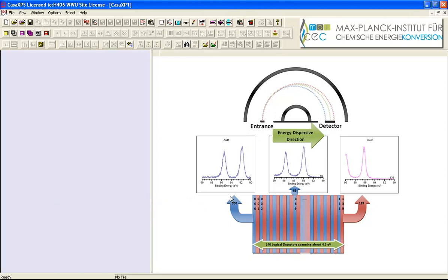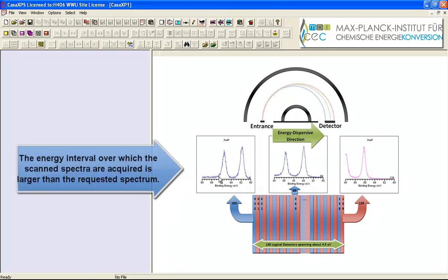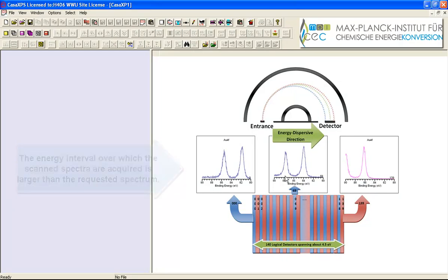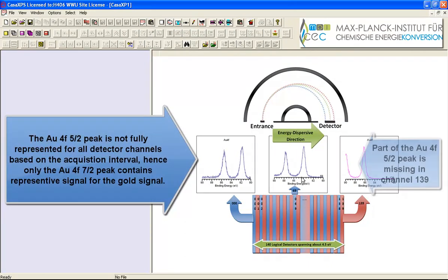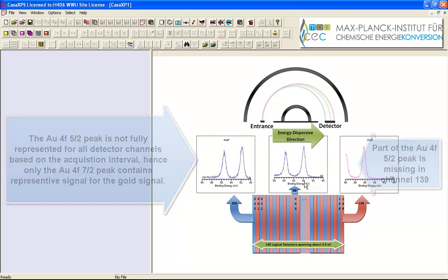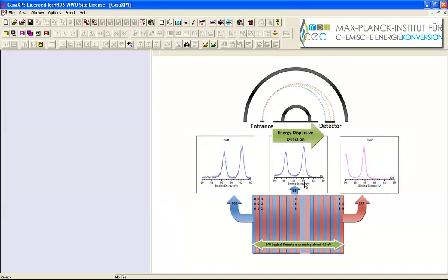So the first one might produce this spectrum here and the last one produces this spectrum and one in the middle would produce the more expected form here where the peak of interest appears somewhere around about 84 binding energy. And you can see that they are actually shifted in different directions depending on which detector has been used.